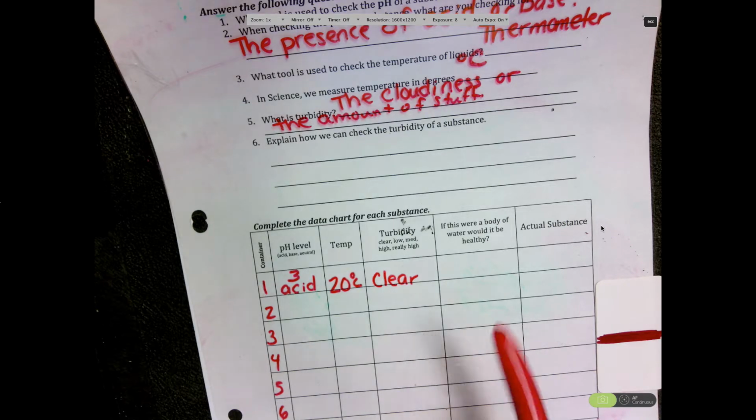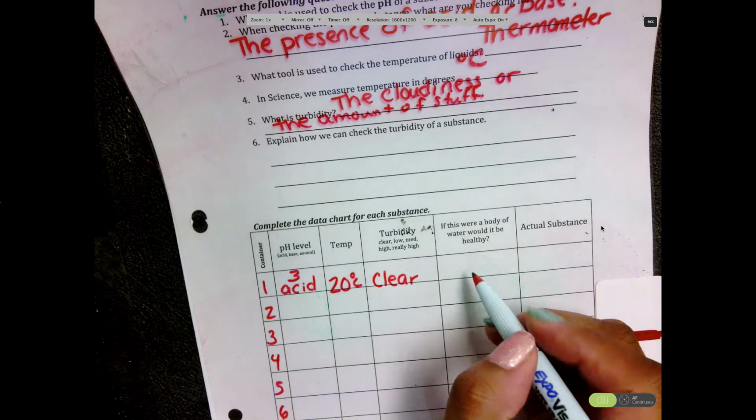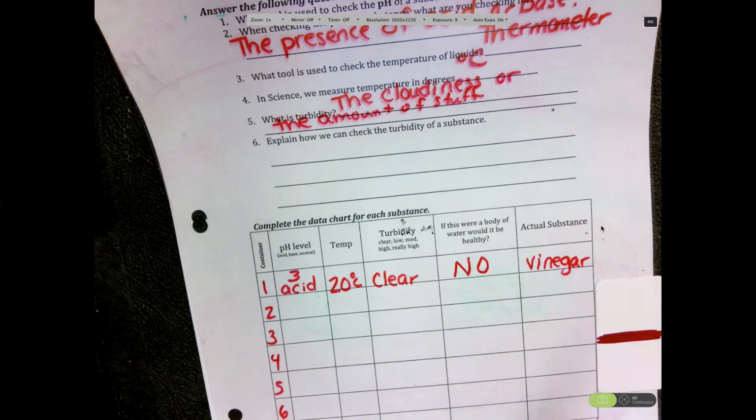Because our question is, if this were a body of water, would it be healthy? Does it pass the pH test? No, because it should be a pH of what? 6.5 to 8.5 for it to be okay or be healthy. Does that pass the temperature test? Yes, because I told you to change it to 20 degrees. Does it pass the turbidity? Yes. But would it be considered healthy? No. Why? It doesn't pass the pH test. This substance is actually vinegar.